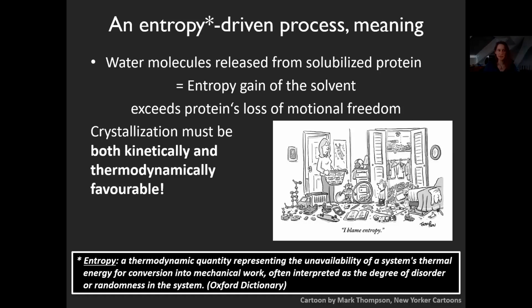Now, crystallization is an entropy-driven process, meaning that water molecules are released from solubilized protein. So if you try to remember what entropy is, it's basically more messy, a thermodynamic quantity representing the unavailability of a system's thermal energy for conversion into mechanical work, often interpreted as the degree of disorder or randomness in the system. This is the dictionary definition.